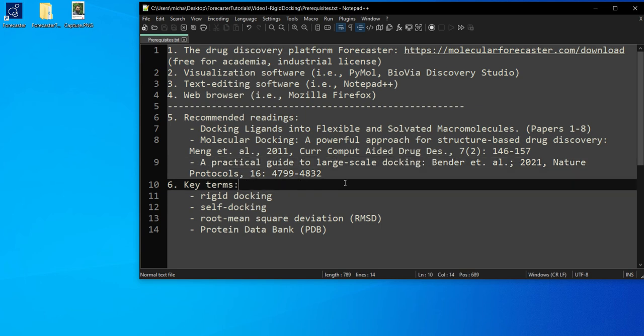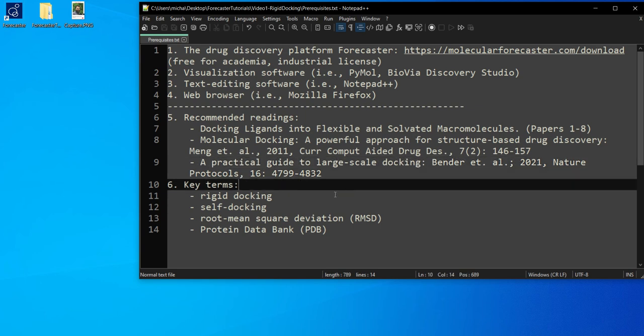Some key terms that I will be using in this tutorial are rigid docking, self docking, root mean square deviation or RMSD and a protein data bank or PDB.